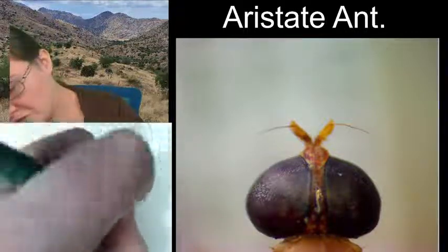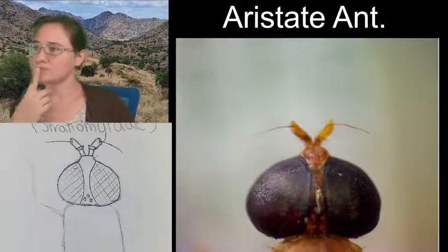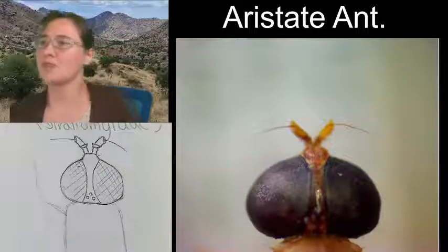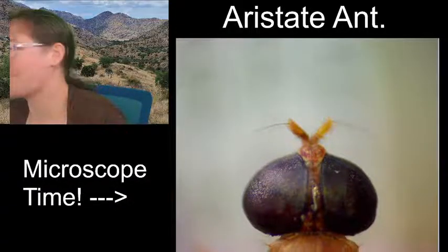I'm going to leave it alone. All right, let's go ahead and move on to the thoracic region of my fly.